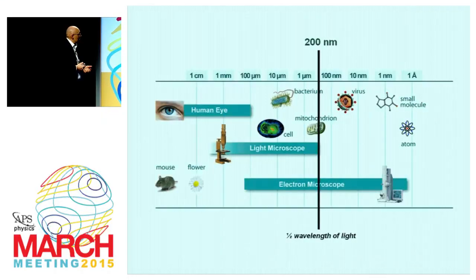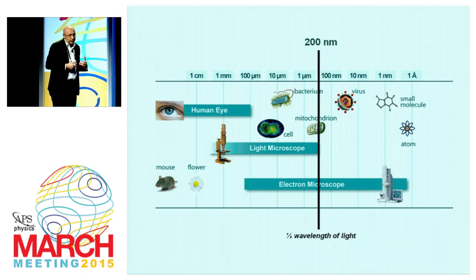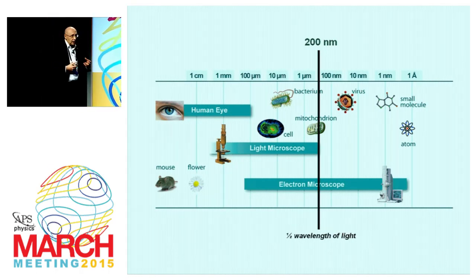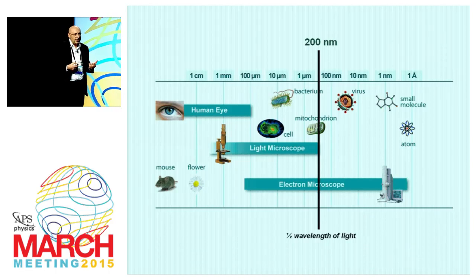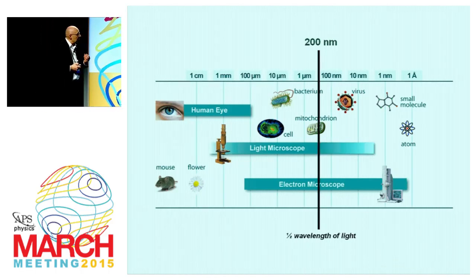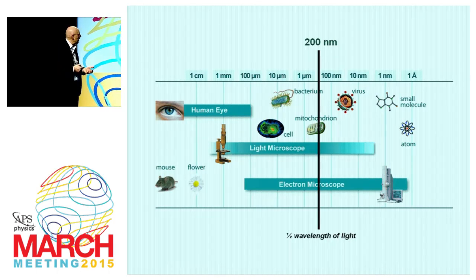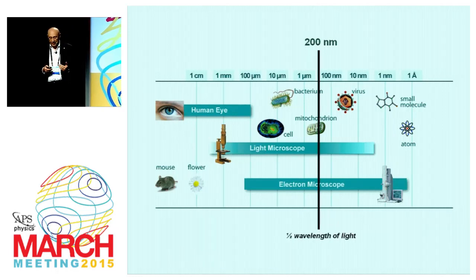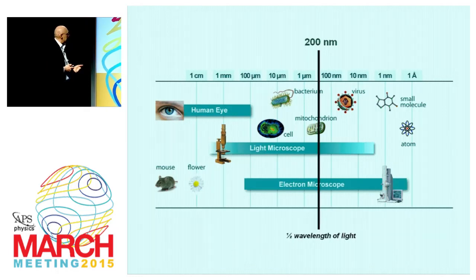And so you can imagine that because of the diffraction resolution barrier, and the inability of the microscope to see structural details below this level, a lot of information is lost in the cell. And therefore, it's clear that if you manage to come up with a fluorescence microscope that has a much higher spatial resolution that overcomes the diffraction barrier, a lot would be gained in the life sciences, and this would have a tremendous impact in the life sciences.